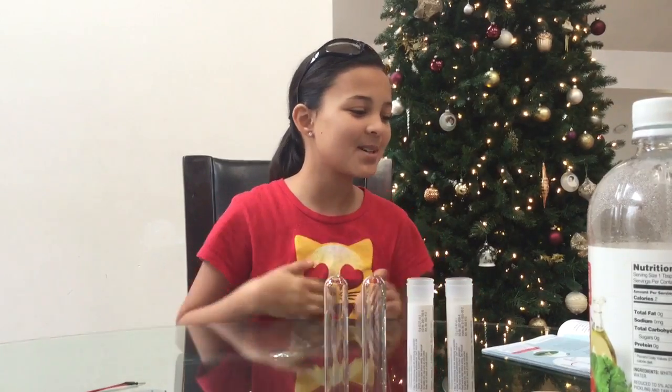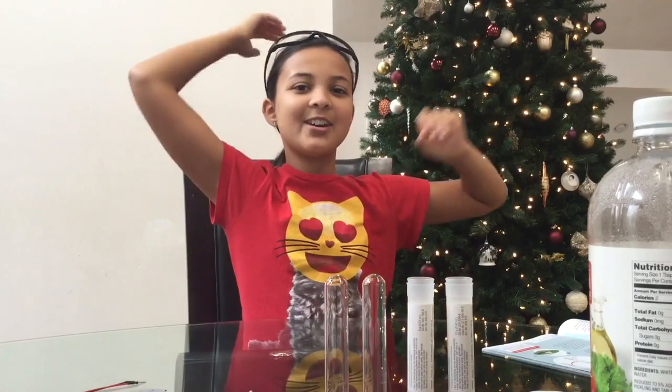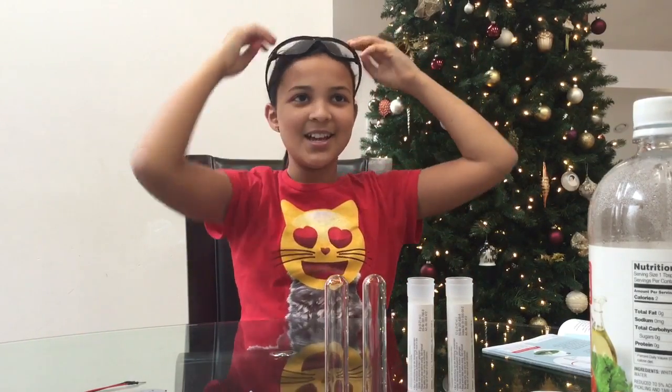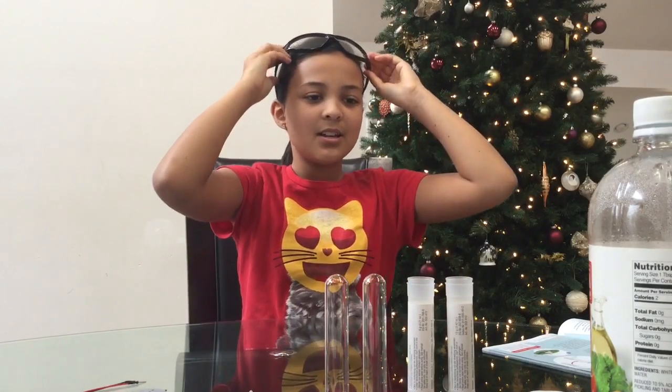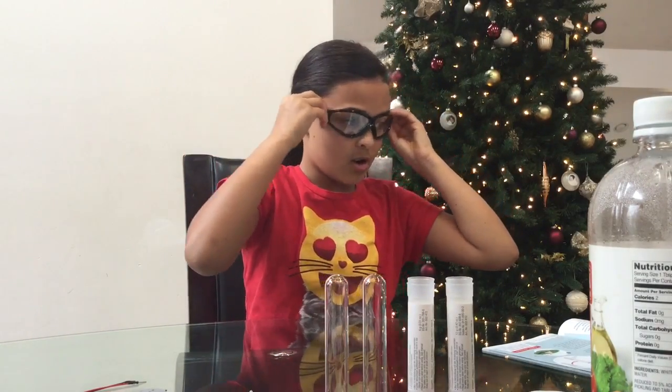Hi, I'm Taylor. This is my experiment called Flame Out. First, you put your hair up like I already do. And then you always remember your safety goggles, so we can put these on.